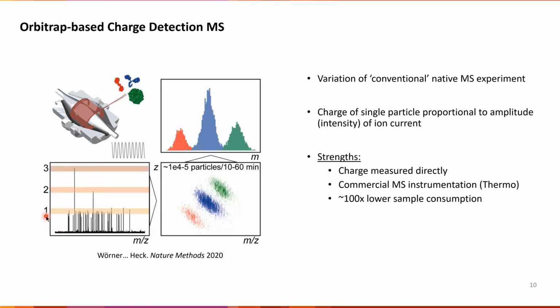But what you'll notice is that when you look at it, you can actually detect ions. So these are the ions here. And actually each of these ions here as a vertical line is a single ion within the detector. So we can actually begin to start counting ions in this approach. And you can see here also that there's peaks that are double and triple the height. And these correspond to 2 and 3 ions of the same mass to charge.